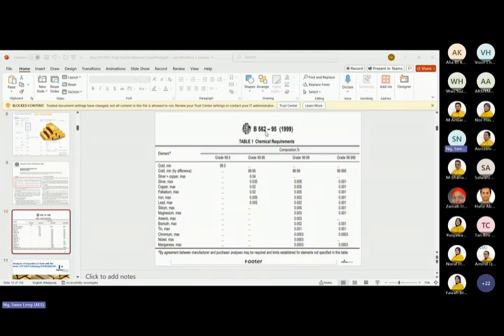When you ask me to test whether your gold is 99.5 or 99.95, the elements that I test are copper, palladium, iron, lead, silicon, and so on. If you are in the US, you also test these elements. If you are in Australia, you also test these elements.